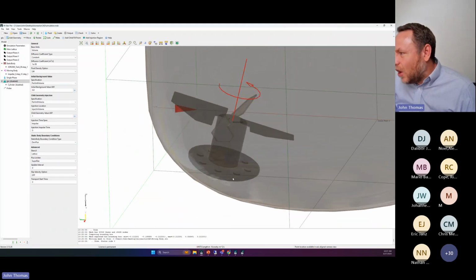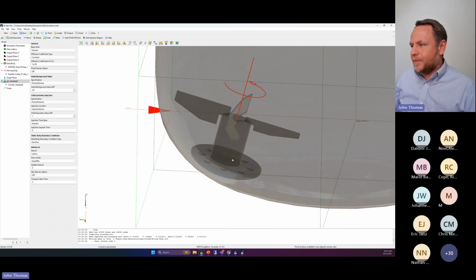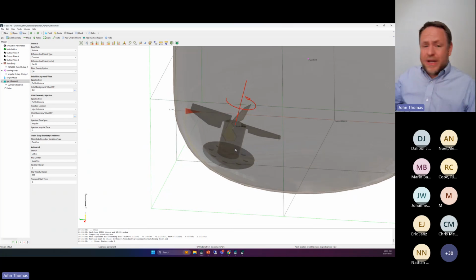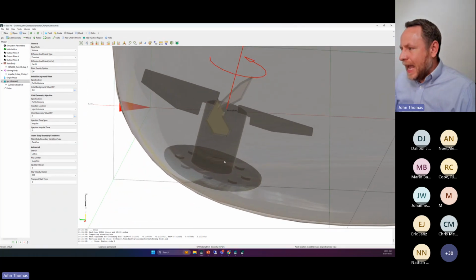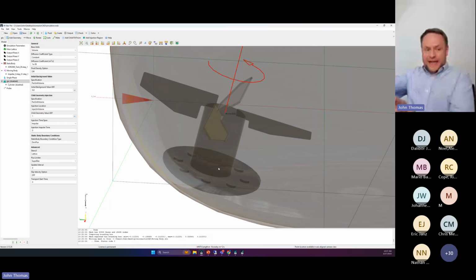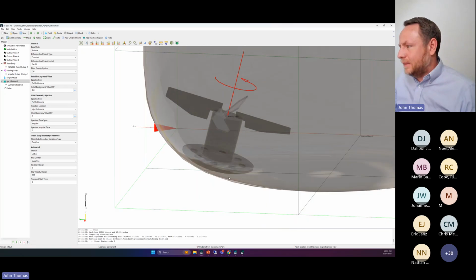So in this XDR 2000 system, we have 8 microspargers, okay? Now, the bubbles coming out of a microsparger are not the size of the microsparger pores. And this can be a discussion after the fact. There's actually some nice literature that explains what the bubble size should be, and we have that baked into the code. But I'll just caveat that point momentarily. A 20 micrometer microsparger does not produce 20 micrometer bubbles, okay? There's published data with cameras down there that show what they come out as, and people develop correlations that speak to that. I'll evoke it and then point in the right direction where to look that up.